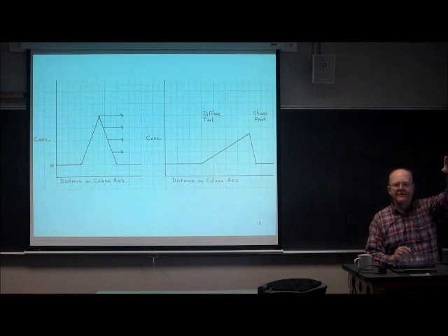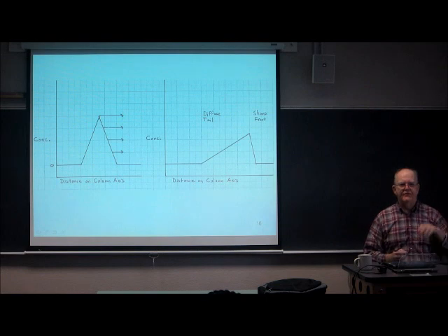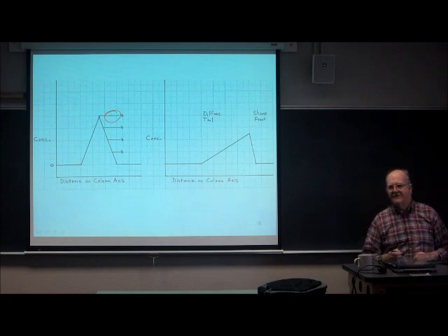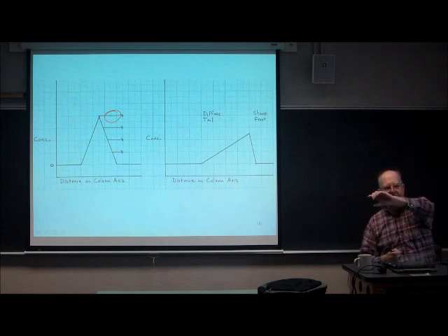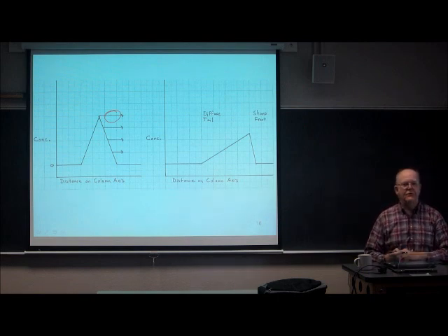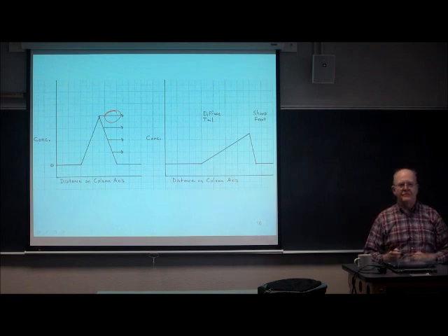So stuff in the beta 3 region is moving at a higher velocity than stuff in the beta 2 region, which is moving at a higher velocity yet than the stuff in the beta 1 region. So these molecules here are moving fast. So I give them a long vector, meaning a high velocity. These molecules have a shorter vector because they're not moving as fast, and so on.